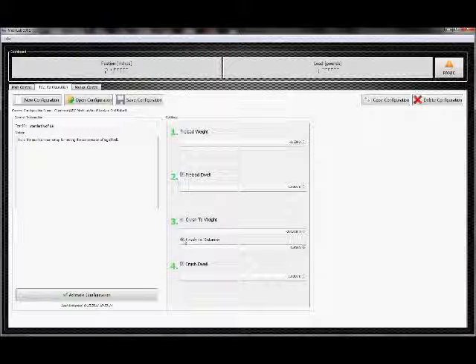If we crush to distance, we do the opposite. We crush to the distance and record the weight. In both tests, we get both of those data items. It's just the way we decide when we stop. Crush dwell is the pause after we reach this distance. The usual is 1 second. We can turn it off and come right back down if we like.